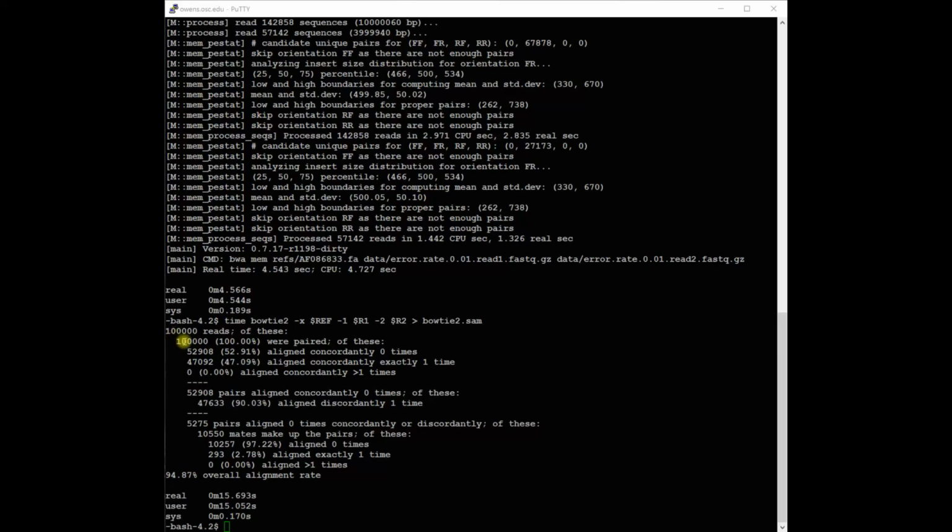It means there are 100,000 reads that are paired. So we can say there are 100,000 fragments, and in one fragment, it has 2 reads. And the distance between the 2 reads should be in a well-defined range. It cannot be over 10,000. It should be reasonable. Depends on library preparation. I would say it's something between 200 to 400 base pair.